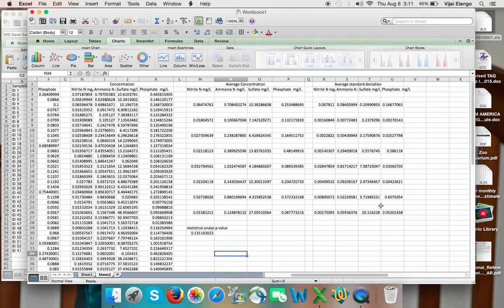You also have to calculate a percentage recovery. That is something we will talk over in class. But this is the final table I want.